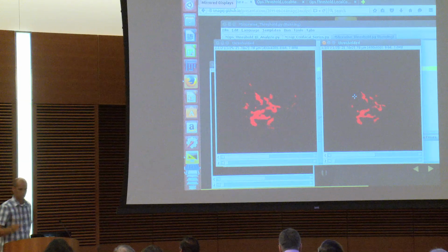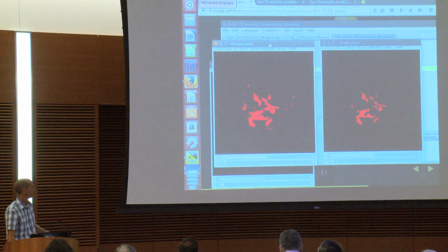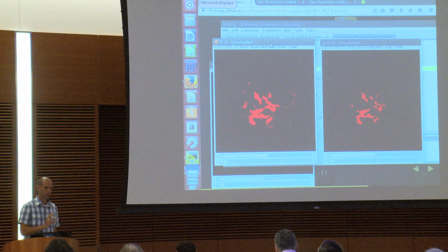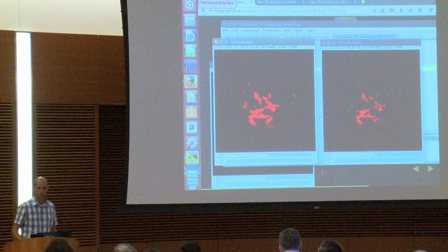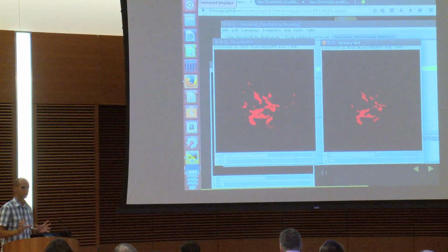So the first time we ran it, it applied automatic thresholding to each slice individually. So the histograms that the threshold was determined from were made using slice data. The second time, it used 3-dimensional data for the thresholding.